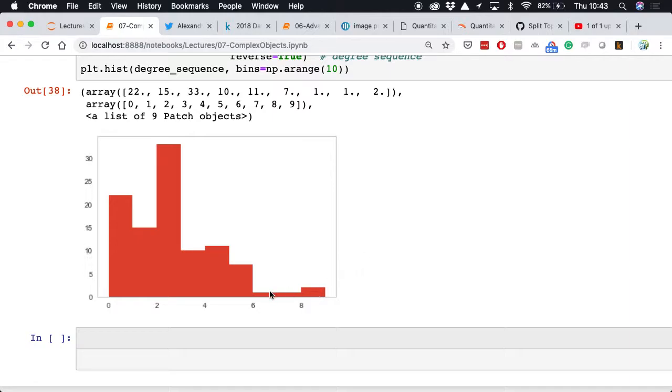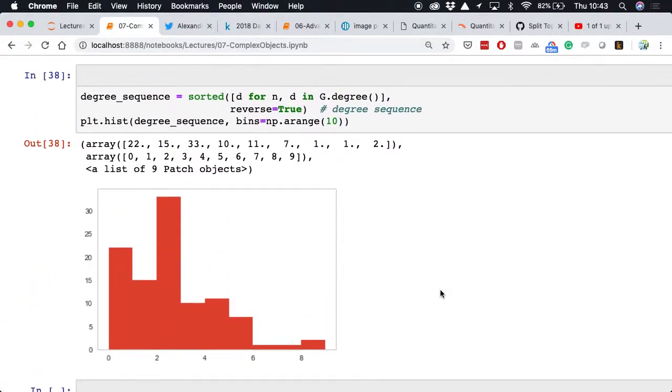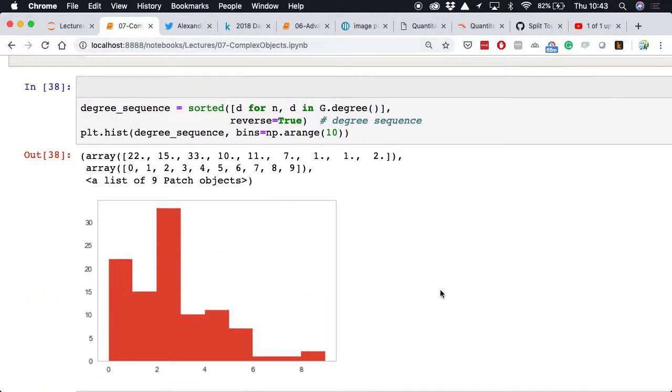It makes it a lot easier to summarize our giant image into one number, by saying the average degree connectedness of the nodes is this. If you can reduce this, then you've made a better sample, and if you increase this, you've made a worse sample. That's our main focus with that. So are there questions on this?